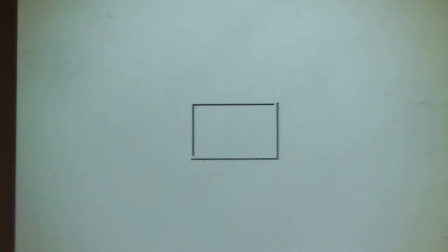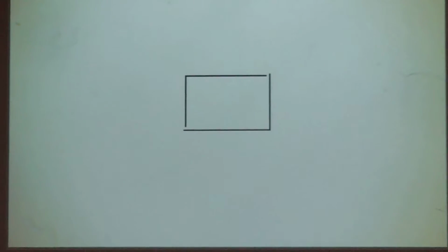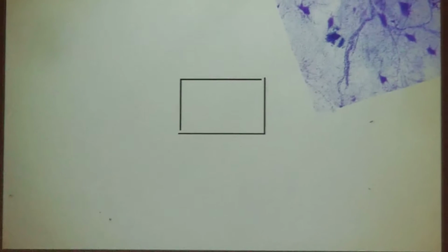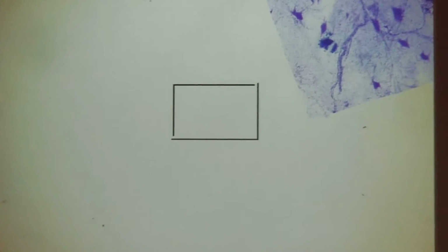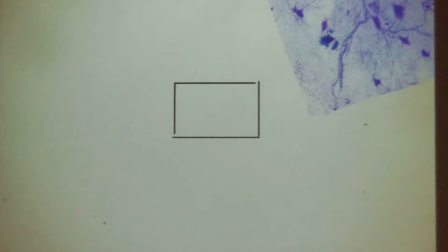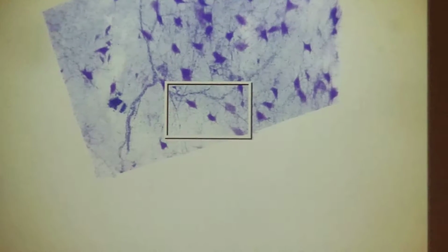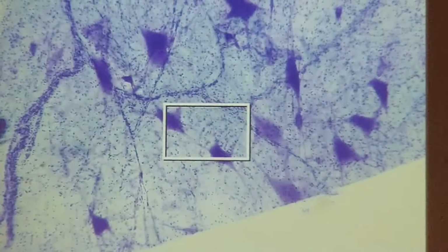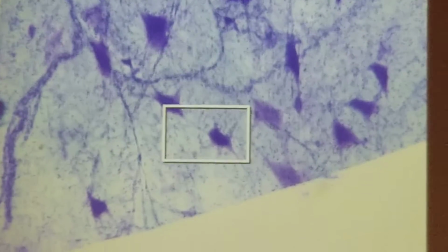All right, last two, we've got nervous tissue, slide number 36. All the different colors that you saw in there, those were the collagen fibers. For nervous tissue, just pick any one of these out. They kind of look like stars. They're star shaped, with little extensions coming off of them. So pick just one of these, whichever one you want. This one right here. Put 40 on that.